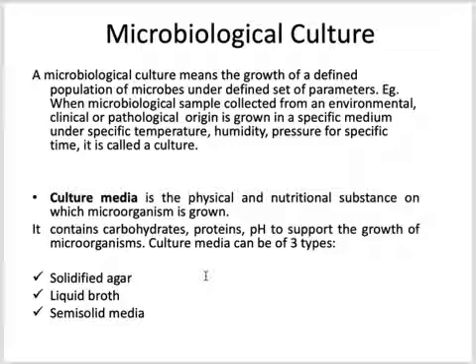So why do we eat food? Because from food we get all the nutrients that we need for our growth. It's also true for bacteria. Bacteria are microorganisms, so for their growth, bacteria also require nutrition, right? That thing is called culture media. Basically, culture media is the food for all microorganisms, or you can say culture media is the food for organisms.